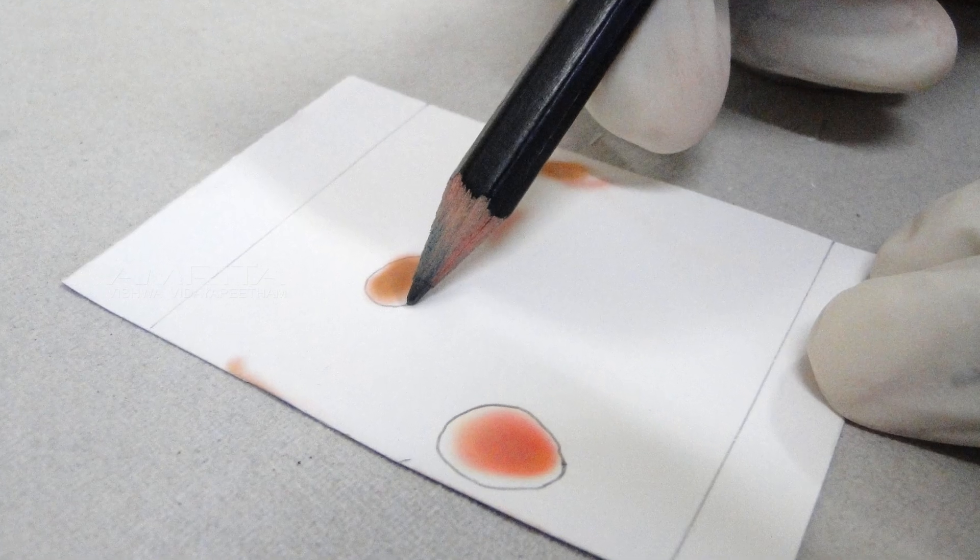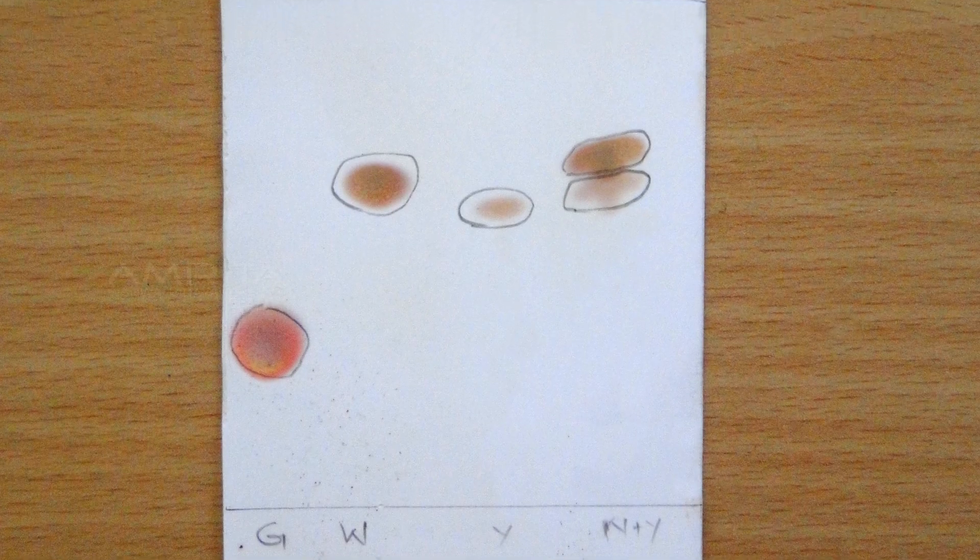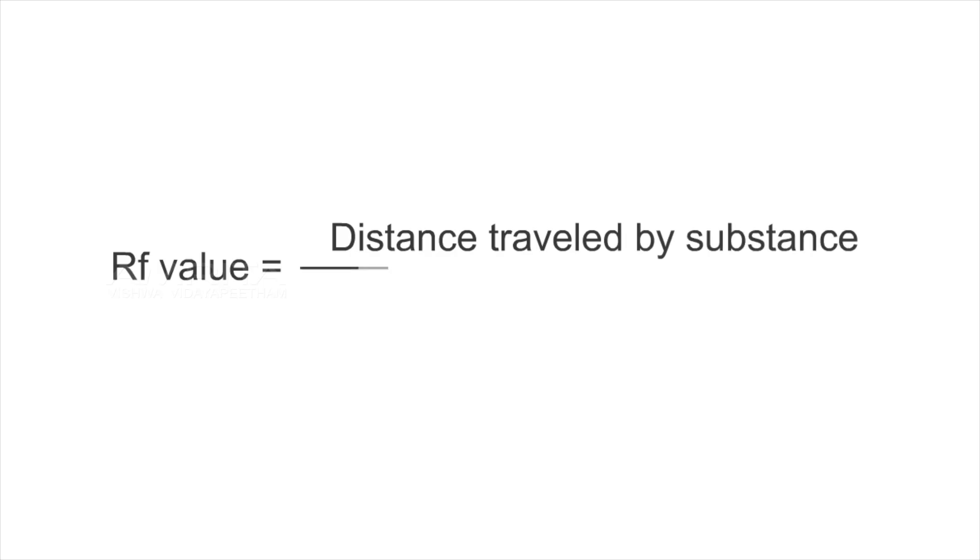After some time, mark the centre of the spots, then measure the distance of the centre of the spots from the origin and calculate the RF values.